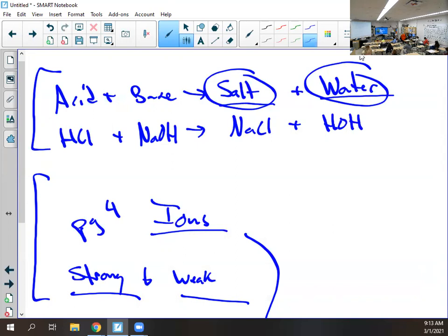You'll just get a few samples and then record them at the top of your table. There's no specific order. Number one, if lemonade was the first thing you tested, you just say lemonade. Next, it says litmus paper color change.